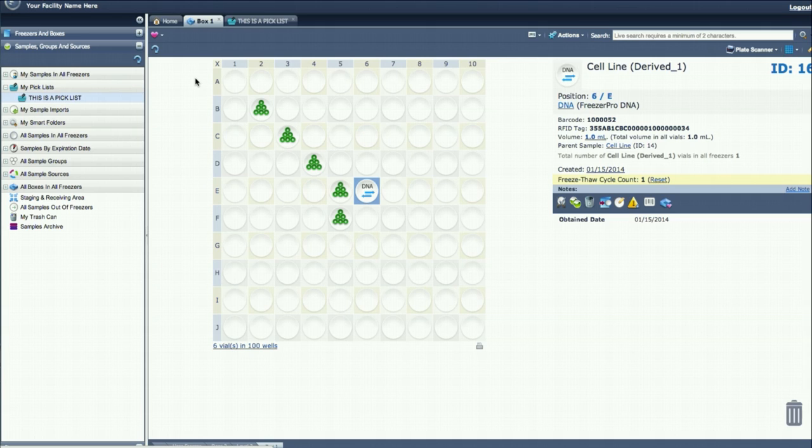This concludes the Power User Working with Samples video tutorial. Up next, we will discuss viewing all sample locations.